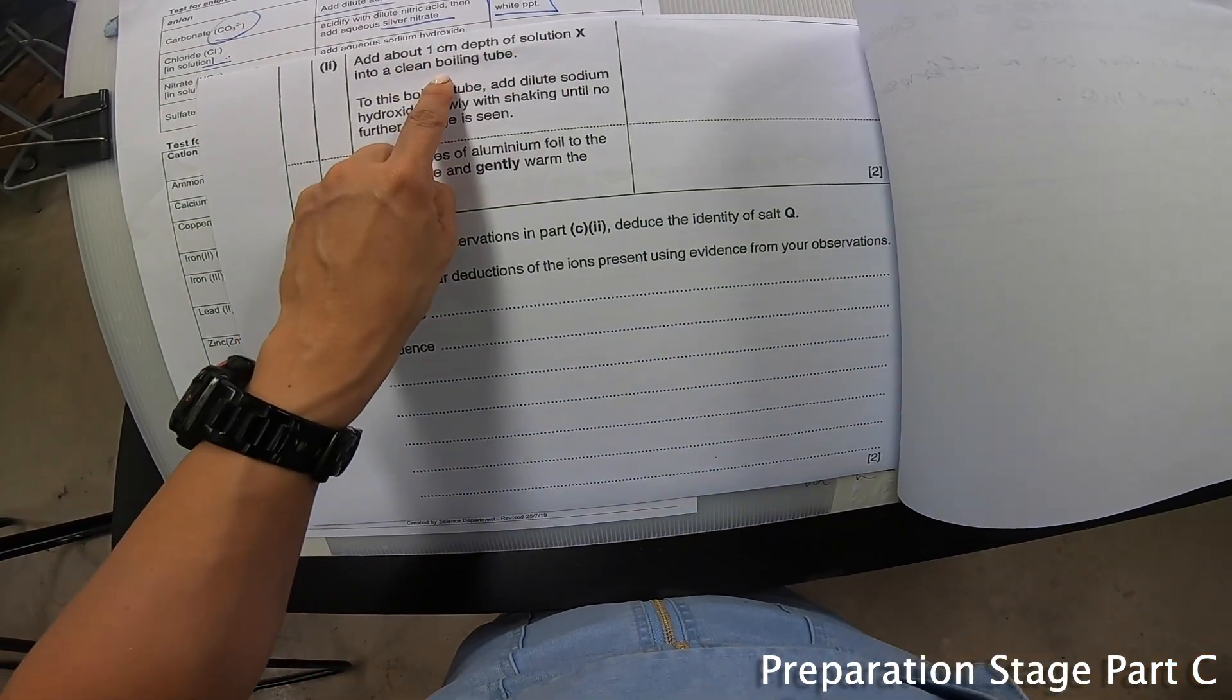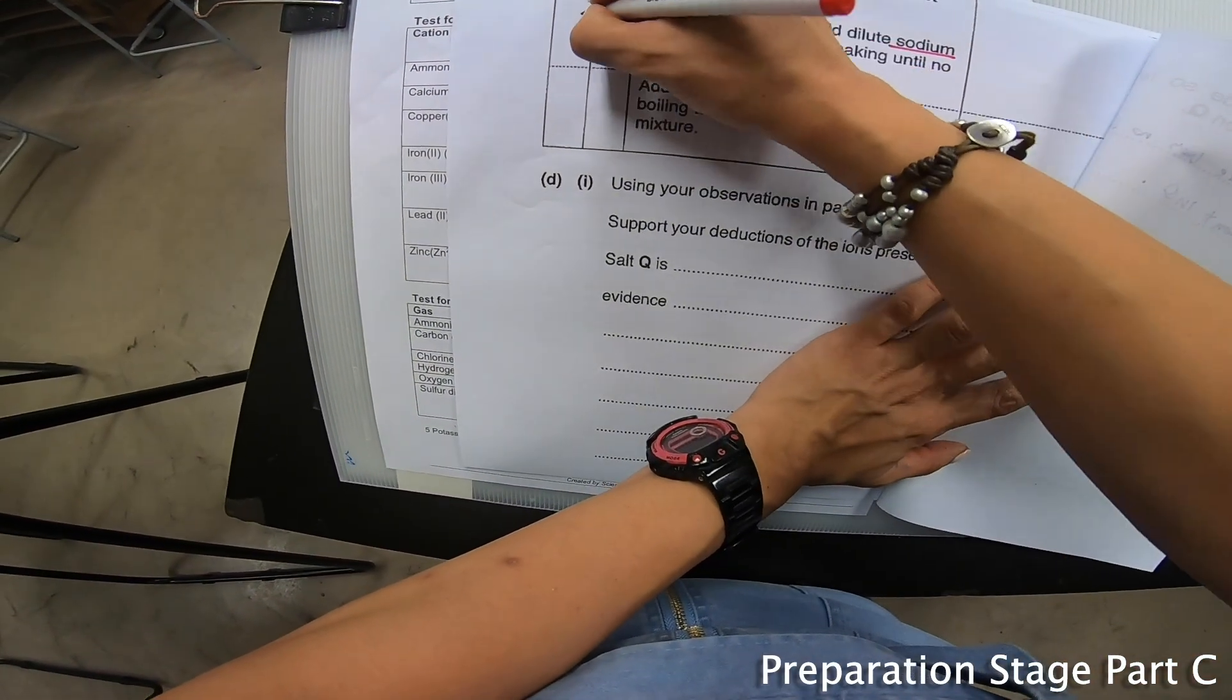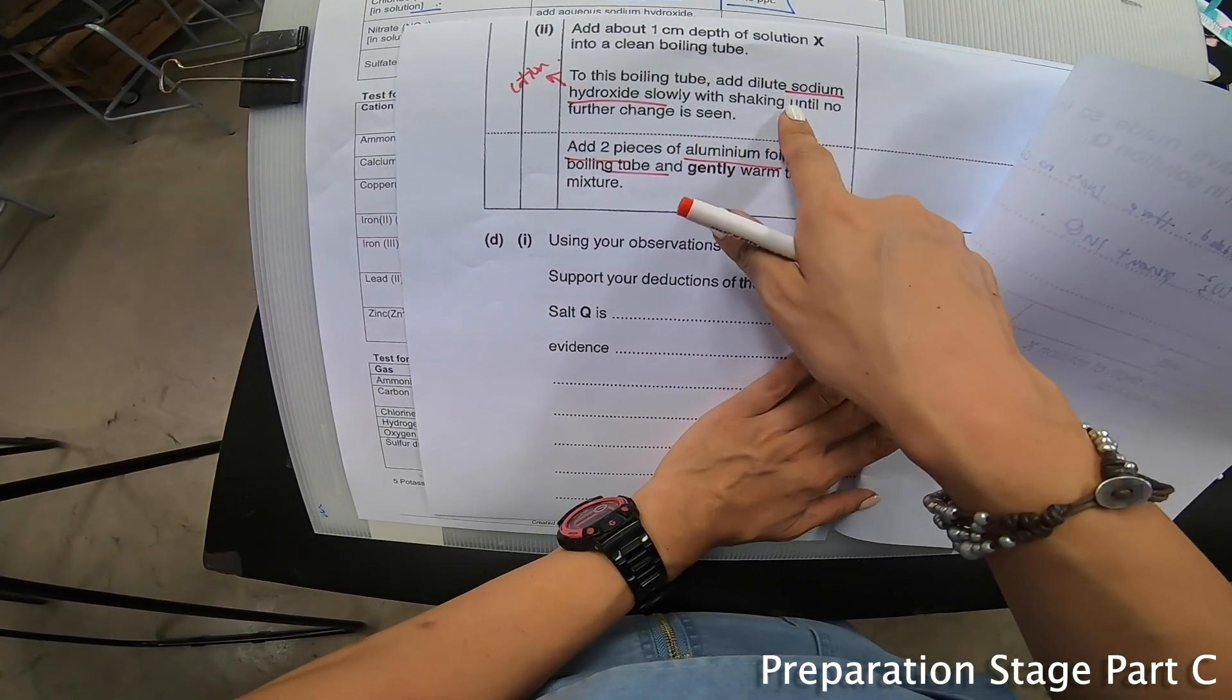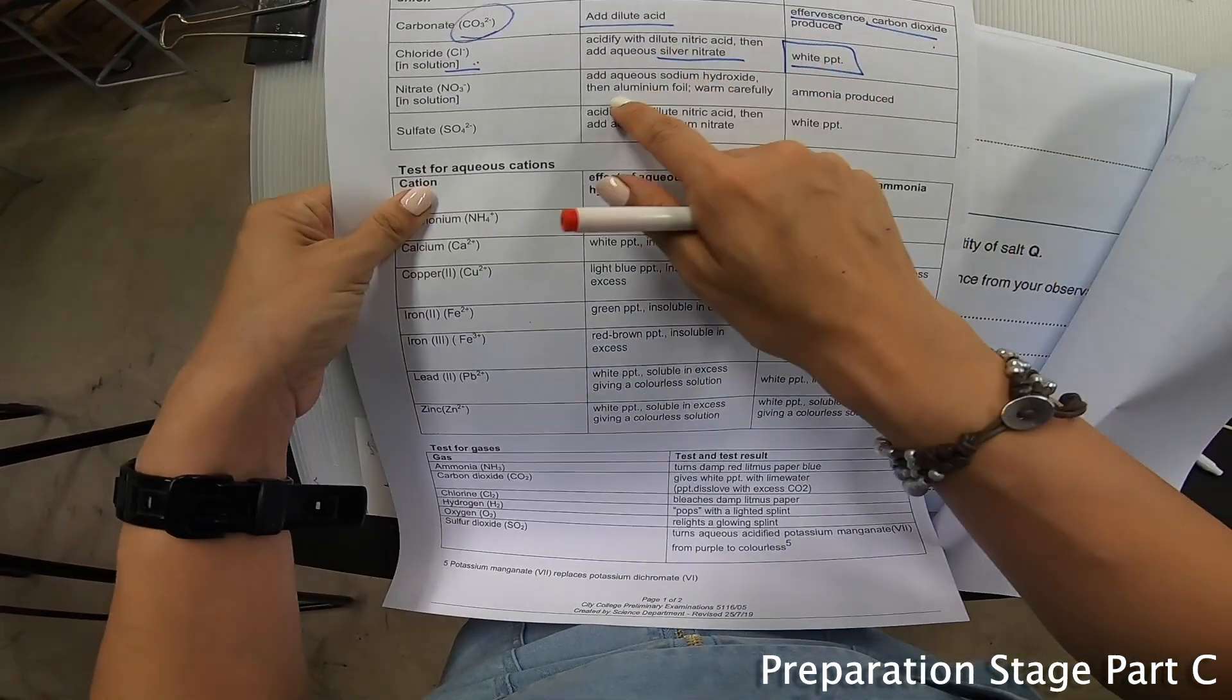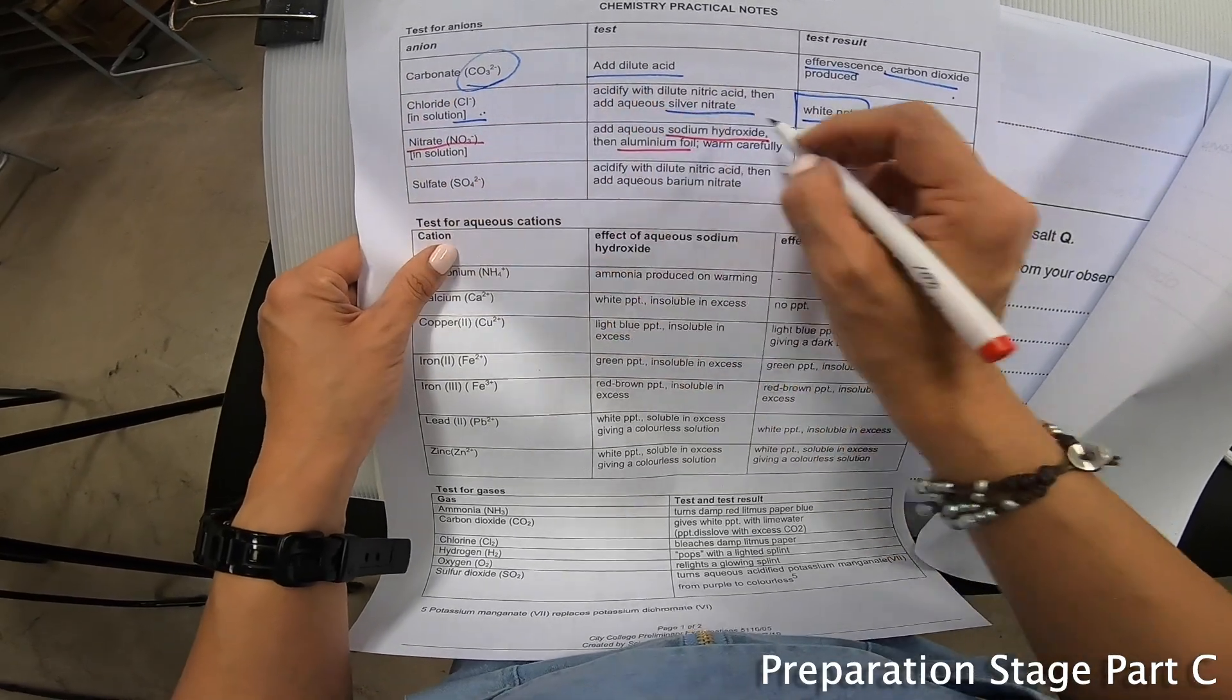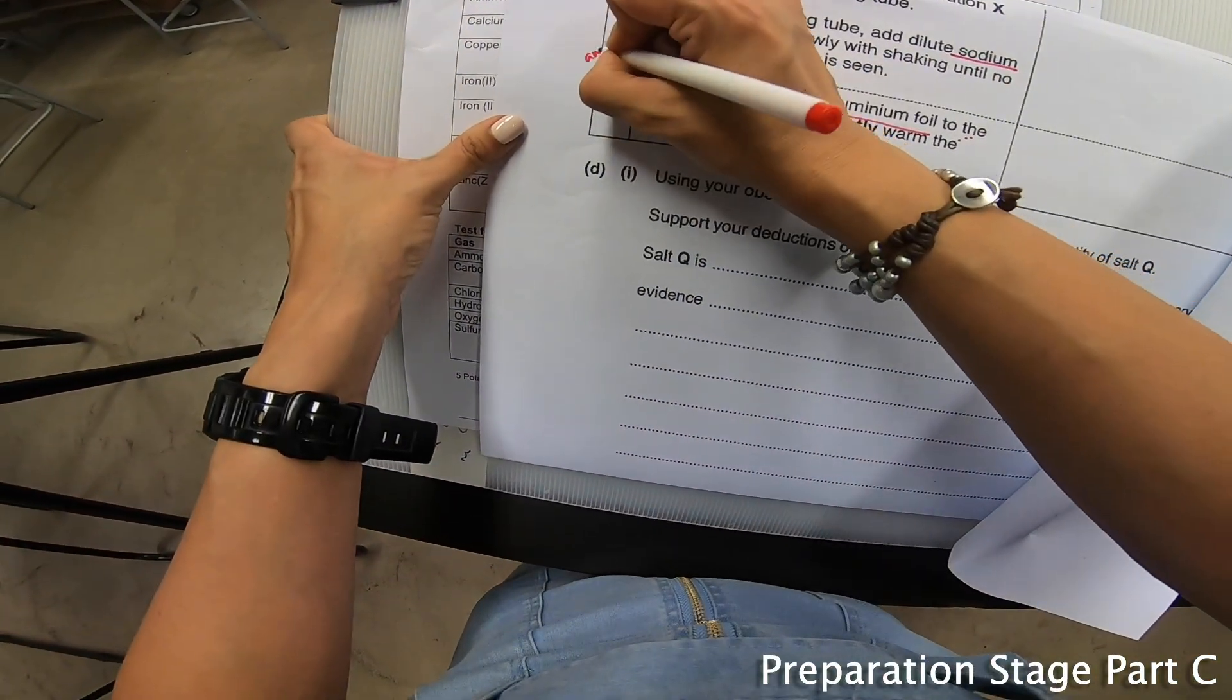Add about one cm depth of X into a clean boiling tube, and add sodium hydroxide slowly with shaking until no further change is seen. This portion is actually test for cation. Then add two pieces of aluminum foil to the boiling tube. This is very smart - first part test for cation, but with the aluminum foil your game changes. This shows you're testing for nitrate. Ammonia gas might be produced if nitrate is present.